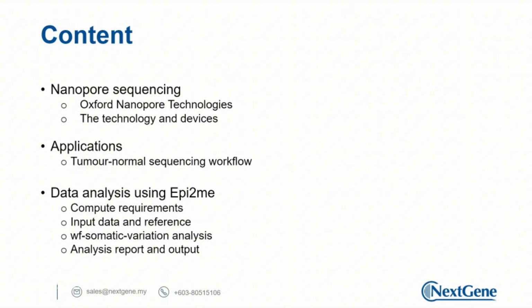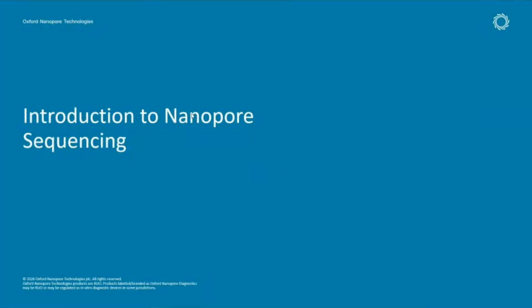Okay, thank you. So today, the topics that we will be going through will be to rehash or slightly refresh a bit on the nanopore sequencing and go deeper into the applications of the tumor normal sequencing workflow, and then how we analyze the data that have been generated by using the tumor normal sequencing workflows. So, introduction to nanopore sequencing.